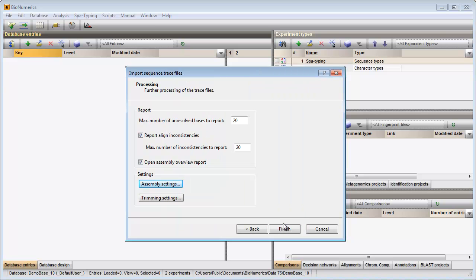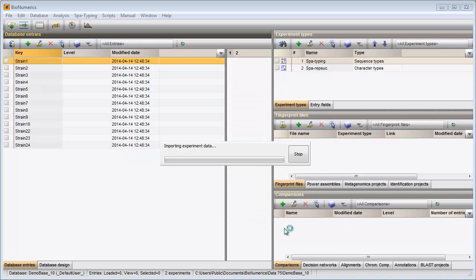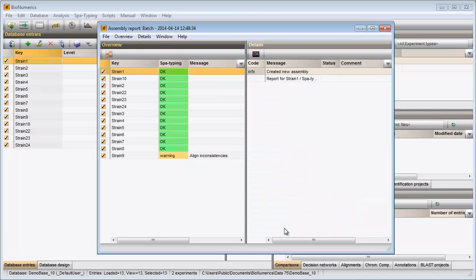The final step is to click finish and the software will start assembling the selected trace files. Once the assembly is complete, an overview report will appear.